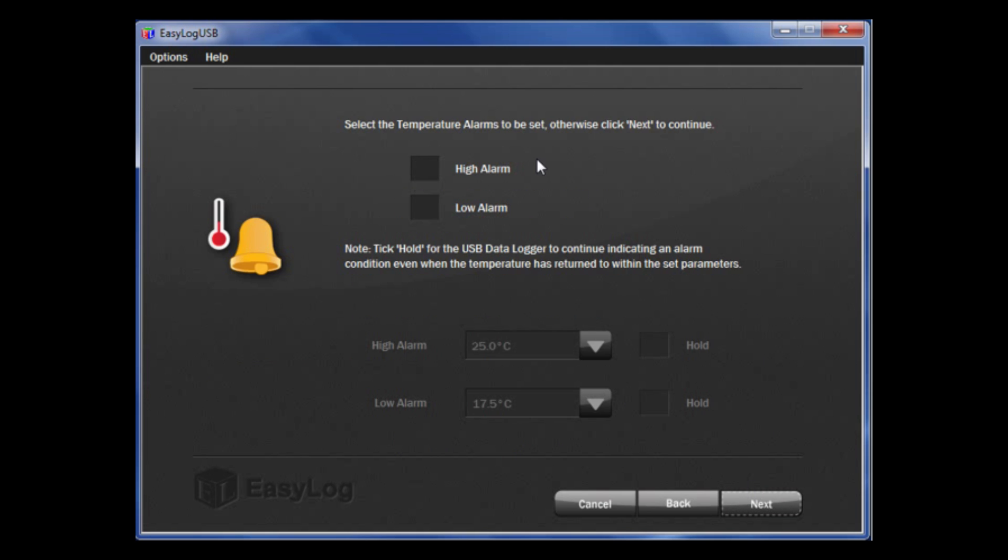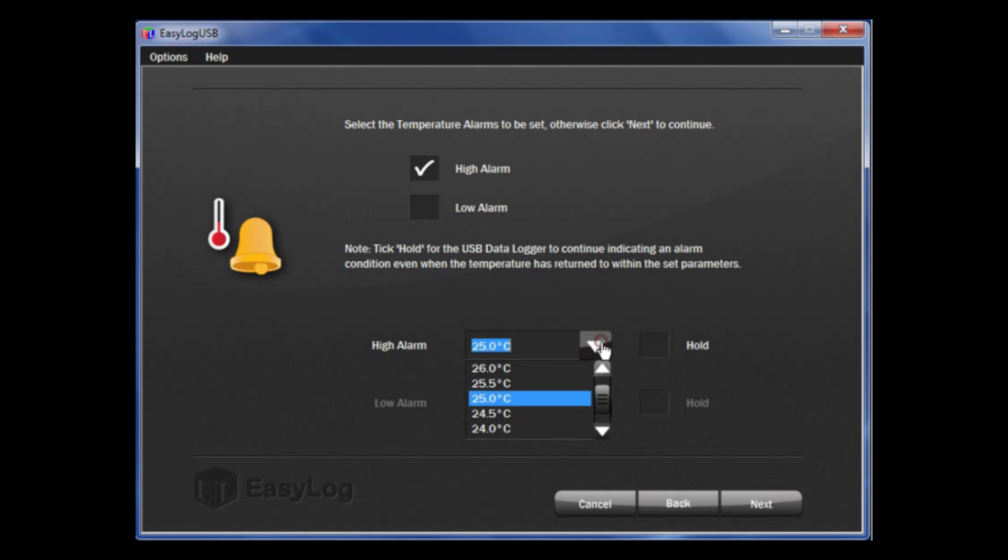The next page is alarm setup. You are going to set alarms for temperature, so click on the tick box here, which will allow us to set the high temperatures. Using the scroll down button here, choose the appropriate value.